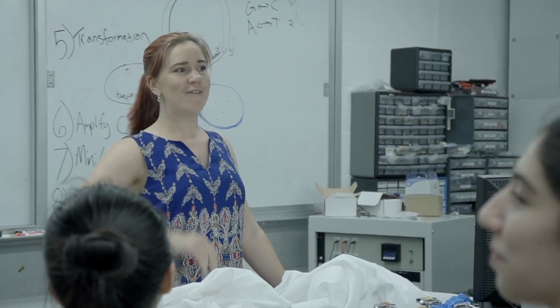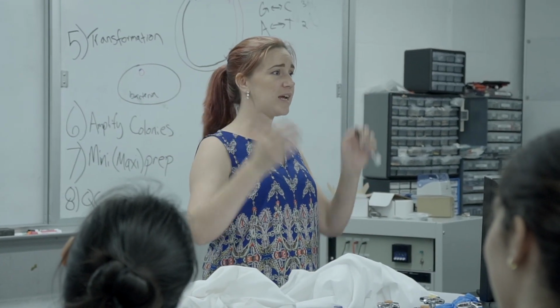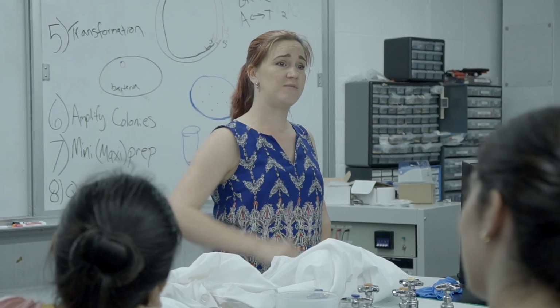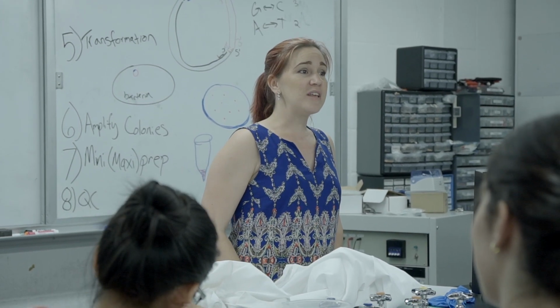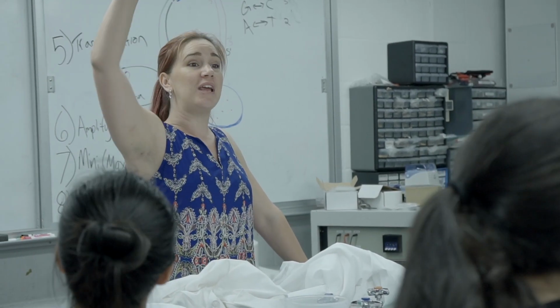So we've gone in just maybe your grandparents' lifetime to yours. Your grandparents maybe learned about DNA in high school, your parents maybe. And now you guys, just on a Thursday afternoon, have used restriction enzymes and cut up DNA and run it on a gel and have all the skills to make a new piece of DNA for some application. I think that's really incredible because I'm sure you hear all the time, oh, when I was a kid we didn't have cell phones. That technology has blown up, but the DNA and the genetic technology, I would argue, is maybe even more.